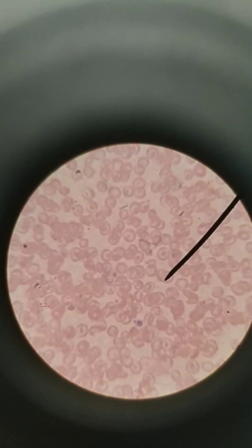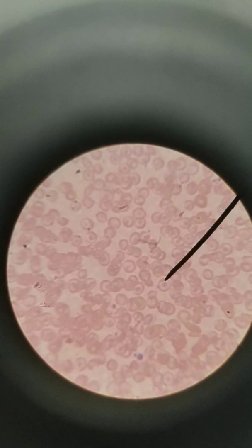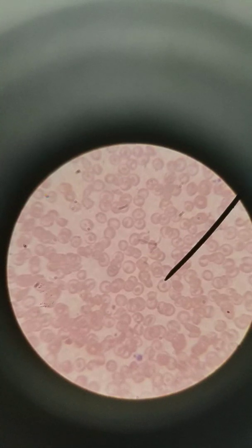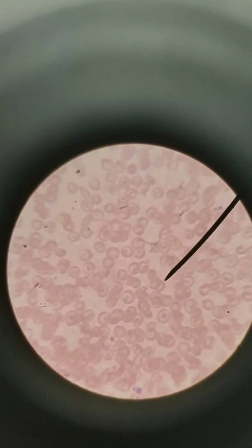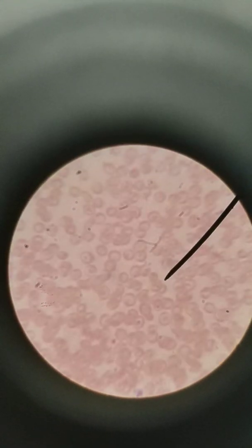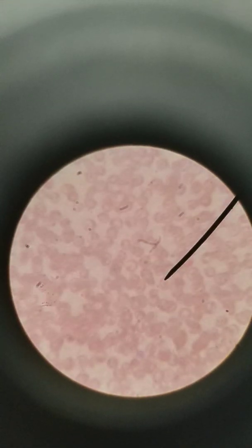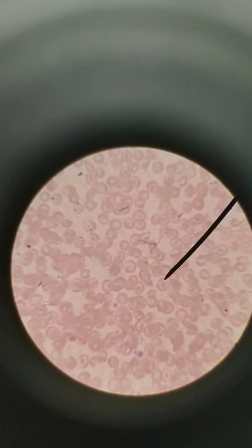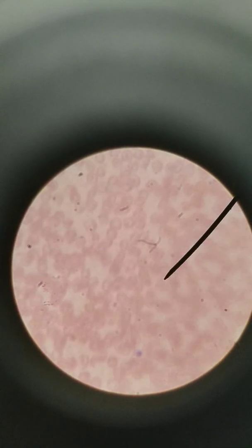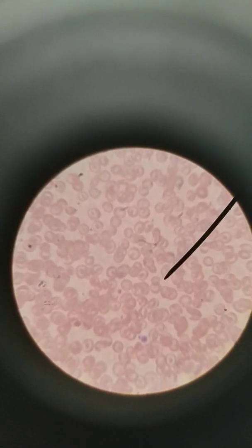Okay. Here we're looking at cells, and immediately we can see something's wrong because look at the center. It's dark. If the center's dark, that means the cell is misshapen. So when we look at this flat view, we can see that the cell is misshapen. Excuse the debris here. Ooh, that oil's getting all weird. Okay, so we can see that cells are misshapen because it's darker in the middle.